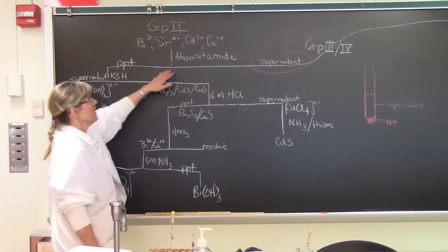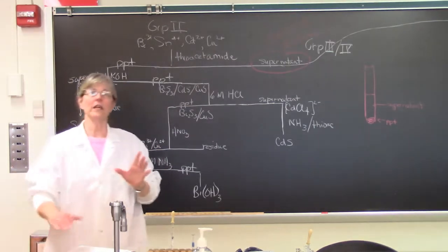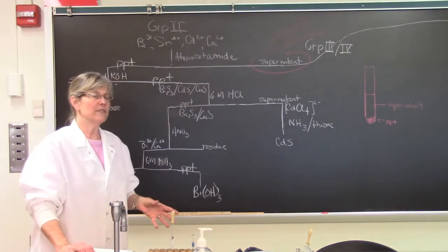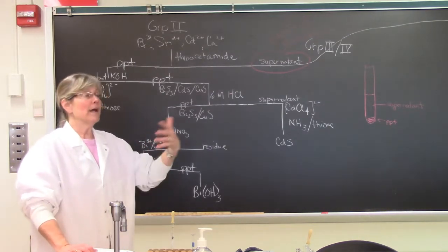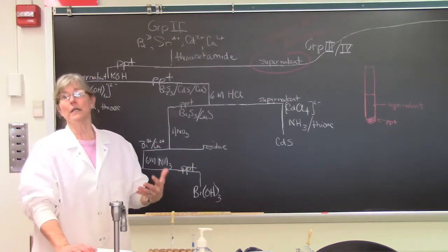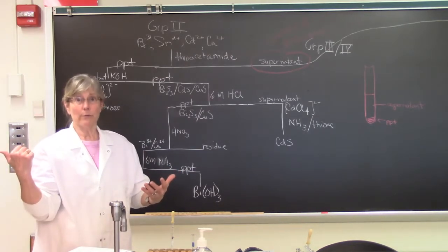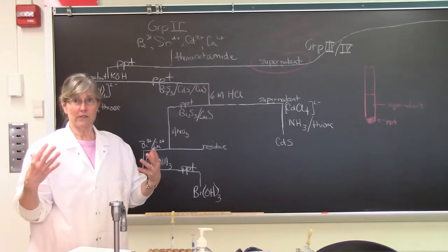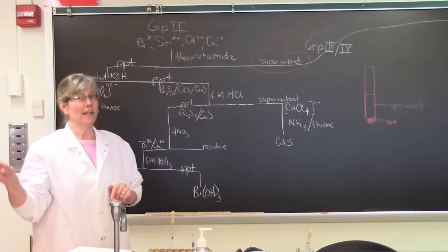And then we're going to add something called thioacetamide. Again, I talked about this extensively on the concepts video. So all I'm going to tell you is that thioacetamide does break down upon heating to form hydrogen sulfide. That's why we do this in the hood, right? Hydrogen sulfide is very nasty, stinks, and will kill you. So we do this in the hood.